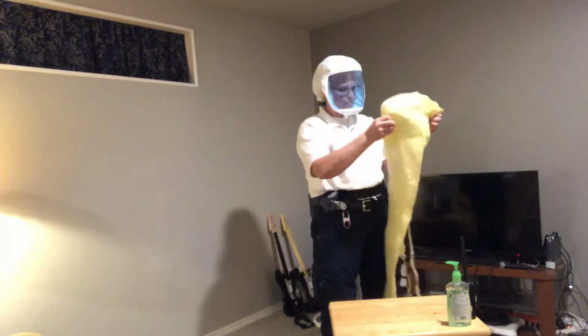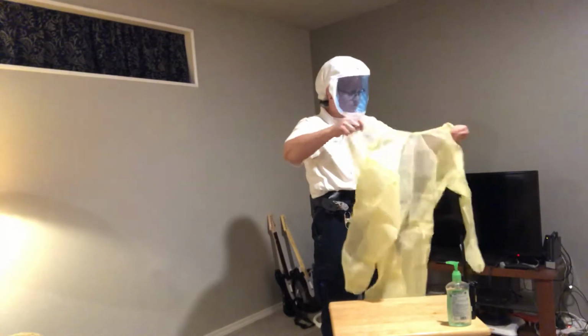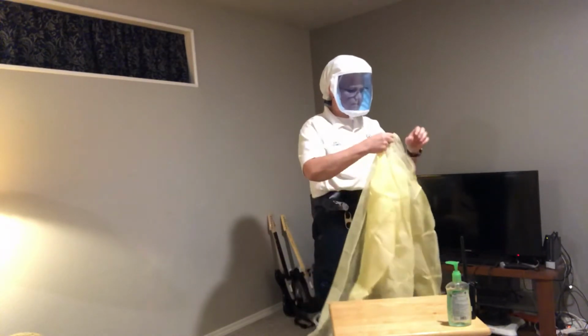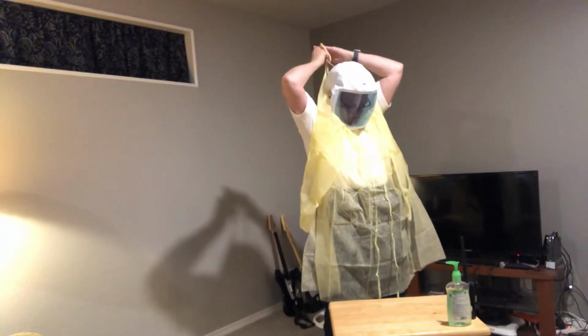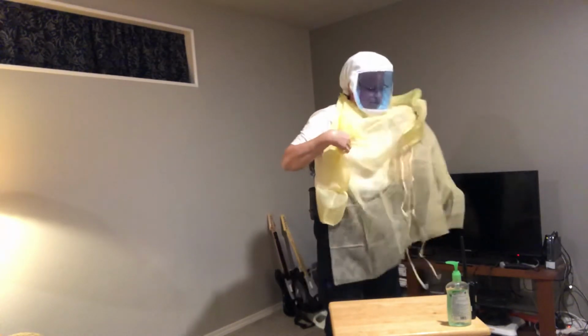And just like in our last PPE video, as I'm sure you all know by now, we're going to tie the gown in the back, and I can help you with the back tie if you need it there, Jody. Thank you. If you're like me, you really suck at tying in the back. If that's the case, have your partner do it. Teamwork makes the dream work. Your partner should be checking anyways. That is correct. Jody just said your partner should be checking anyways. I don't know how well you can hear her in the hood, but I'll just keep repeating everything she says.